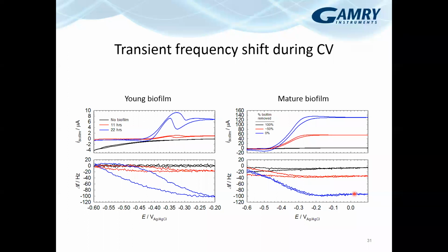So that'll be your first concern. Otherwise, with that kind of system, I would recommend going to maybe a QCM-D system where you're looking at not only the frequency shift, but also the bandwidth, assessing essentially the viscoelasticity of the film that your ionic liquid forms on the sensor.